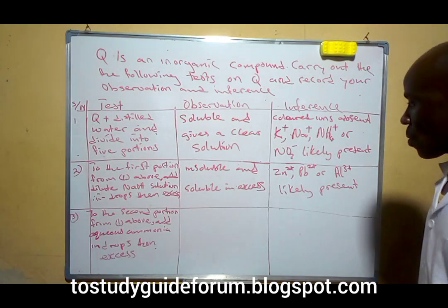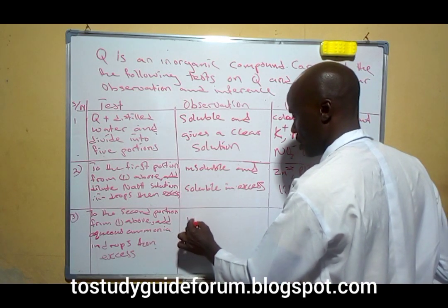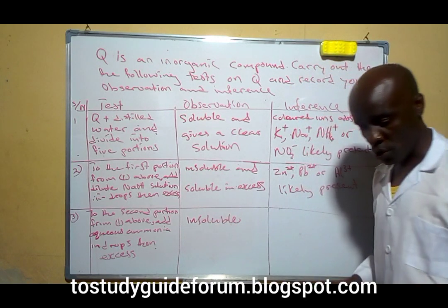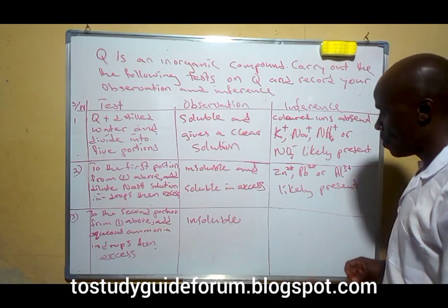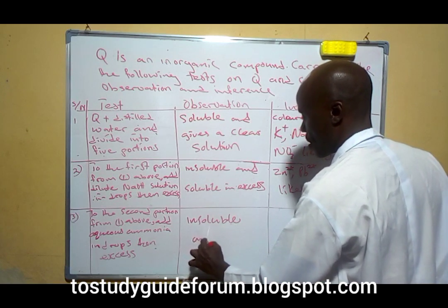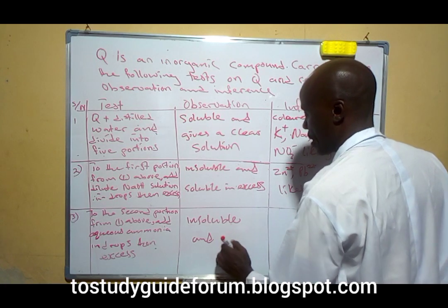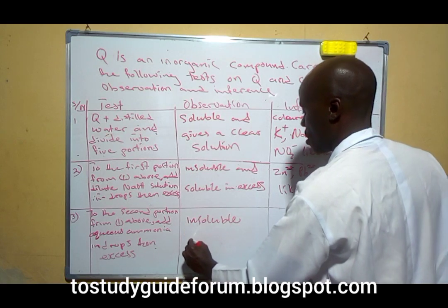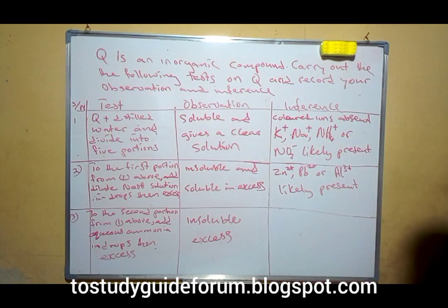What we notice here is that we have an insoluble precipitate, and it is also insoluble in excess.